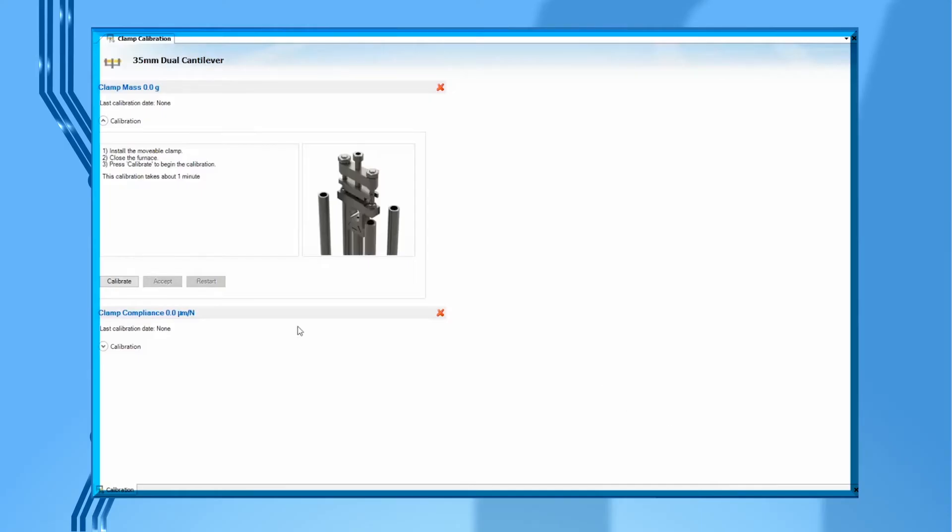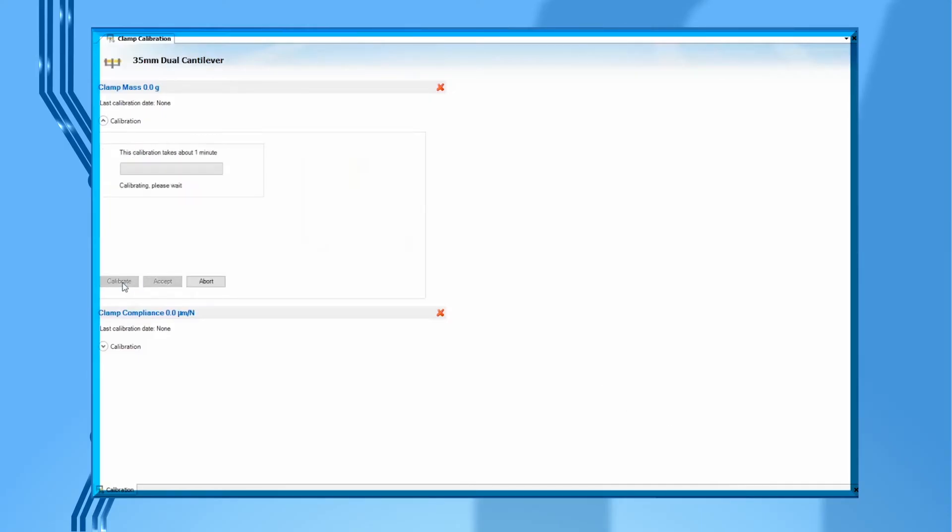From TRIO software, press calibrate to begin. This calibration is to measure the mass of the movable clamp. After it is finished, click on accept.